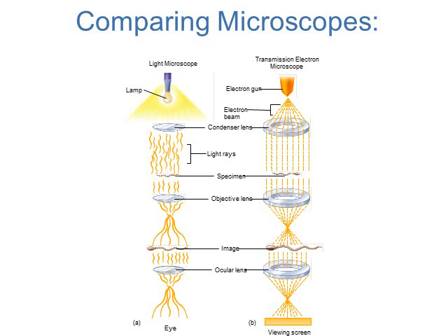That image of the specimen passes through the objective lens, so you magnify it the first time, and then your image will pass through your ocular lens, so you magnify it the second time, and you get to your image at the bottom. With light microscopes, we can view these images just with our eyes. With electron microscopes, the image goes onto a viewing screen. A lot of times nowadays it's just a computer screen that processes the image. And basically that's because you can't look at electrons, so you need to put it onto some type of viewing screen.